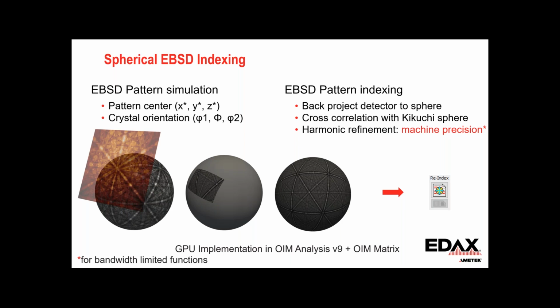That's for a bandwidth limited function, which means in practice you don't actually achieve that because you're truncating in frequency space. But it gets you a much closer starting point than the dictionary potentially. And even though there's a lot of complicated math, at the end, it's just a button, but it's very helpful to understand what's going on behind that button.